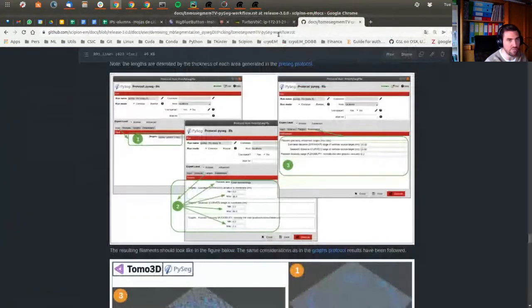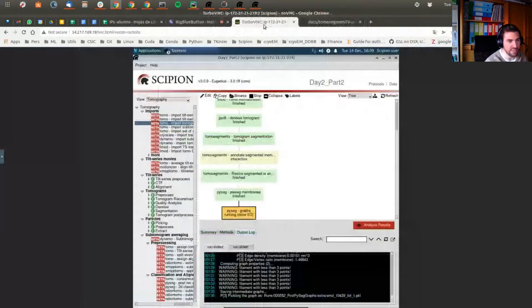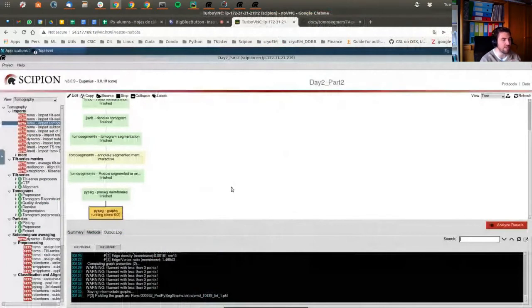Whoa, that doesn't look so good. I don't know why. It's taking much longer than expected on my machine, but I wasn't expecting the one with the disk.